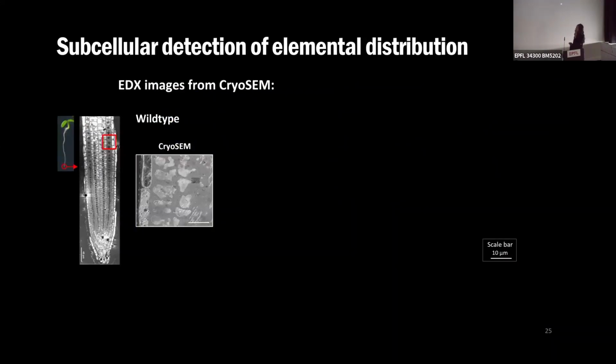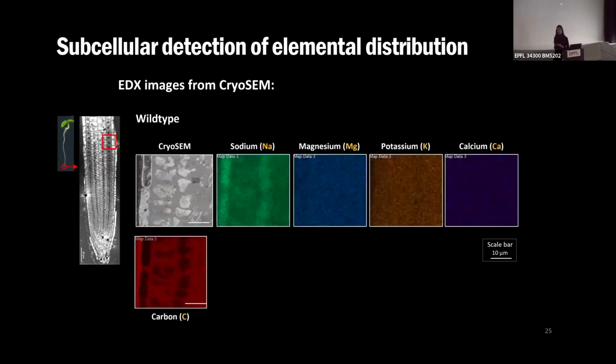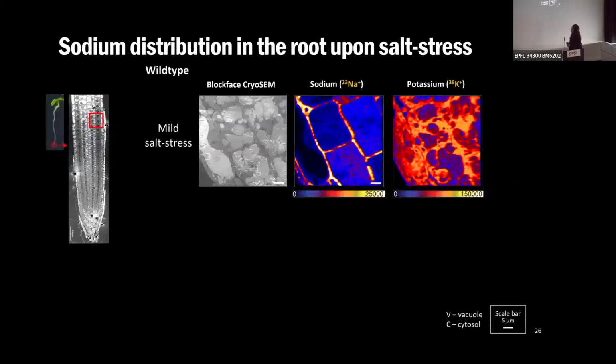But before that, because we use the cryo-SEM, which is one of the best cryo-SEMs we have, we also looked to see if there are other e-beam techniques that work with the cryo-SEM. We looked to see if we can actually look at the same ion distribution with this, but we couldn't really get the same sensitivity and resolution that we get with the NanoSIMS. And so we really have one of the best ways to actually image a cryopreserved sample now with the NanoSIMS.